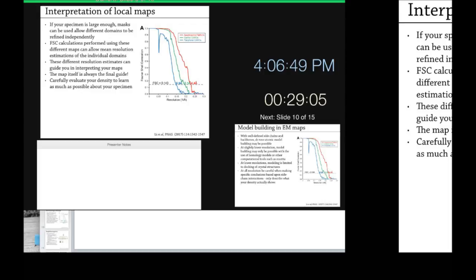But a few years ago no one had even thought of this, and now it's getting more and more precise what you can do with masks. Because we know that lots of different reconstructions have different regions that move independently, and you don't necessarily need to know what every piece is at high resolution together. Sometimes you can go through and calculate different pieces, get a higher resolution map of that, build the reconstruction there, and then put them back in.